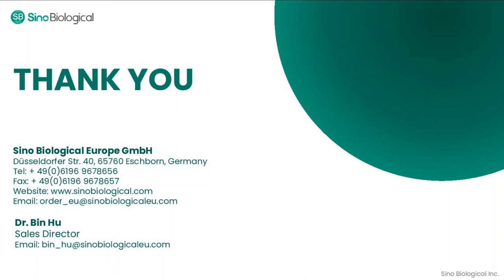Usually, as long as the library size of 10^9 is obtained, then we will move on to the antibody screening step. If we want to construct a much larger library, such as 10^11, then we will perform a lot more rounds of transformation.